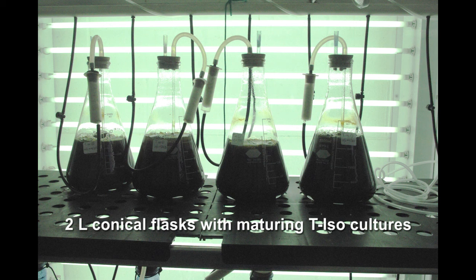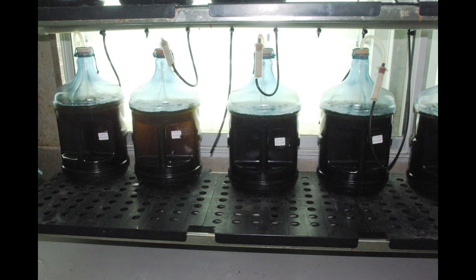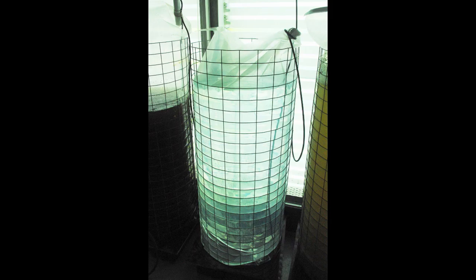Flask-to-flask seeding is the general procedure. Seed 2-litre flasks with 200 mL of TISO culture. 2-litre flasks can also be used to seed carboys. Add 400 mL of TISO to a 10-litre carboy. A 2-litre flask can seed up to 5 carboys.